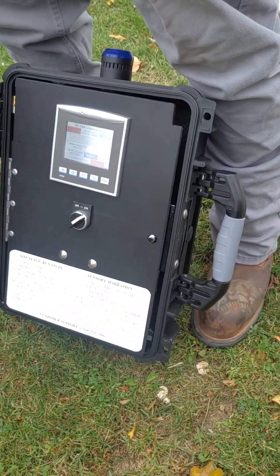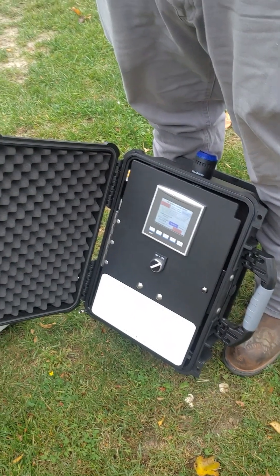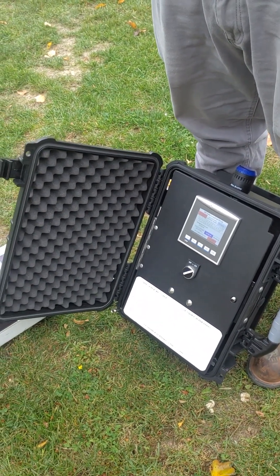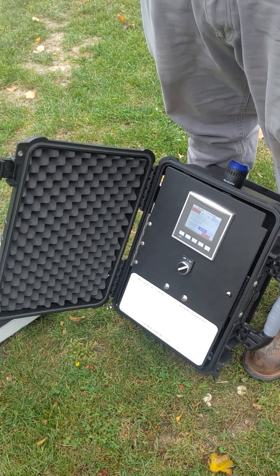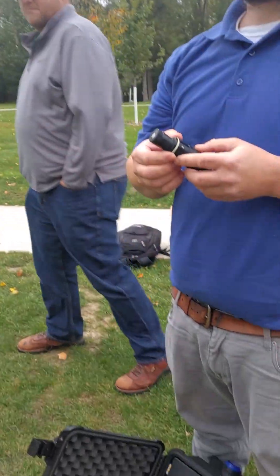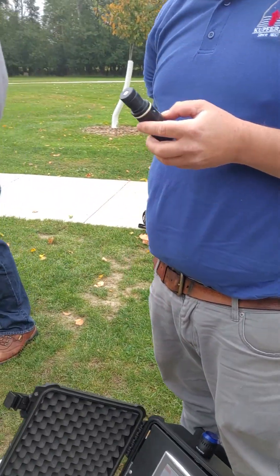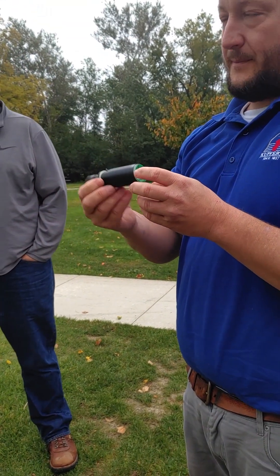It's continuous. You put that little white disc in there. How many samples do you get per membrane? You're going to get three to four months minimum on your membrane, sampling continuously. It's like an online monitor, like in a plant — if you took one every 20 seconds, it's not using anything up. It's more of a pass-fail.